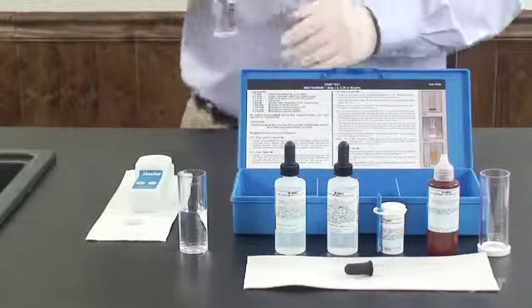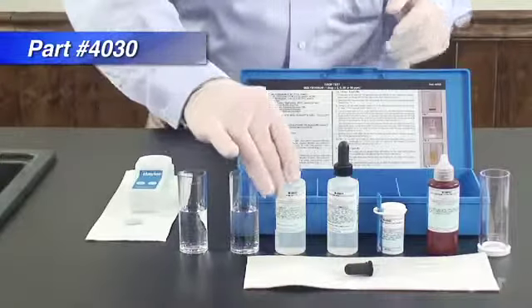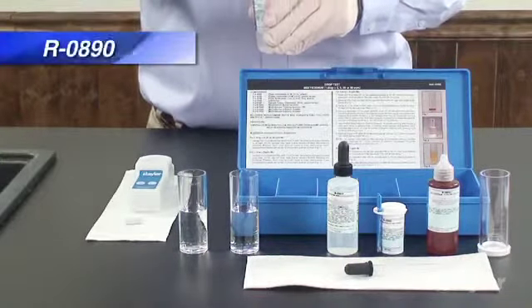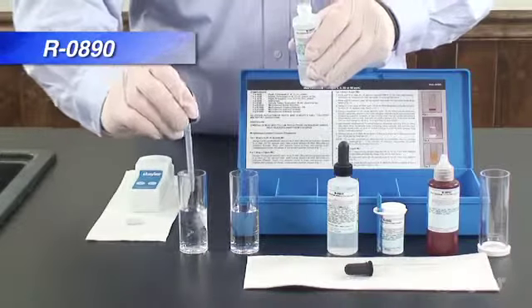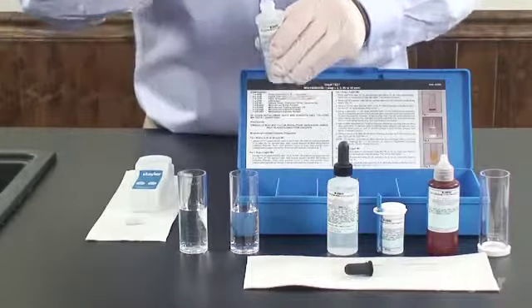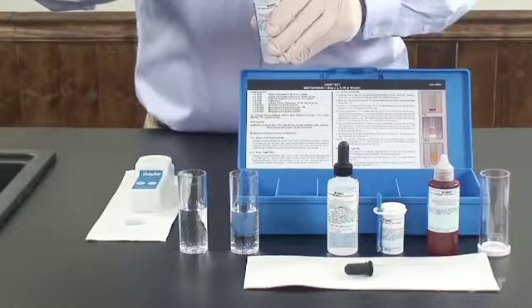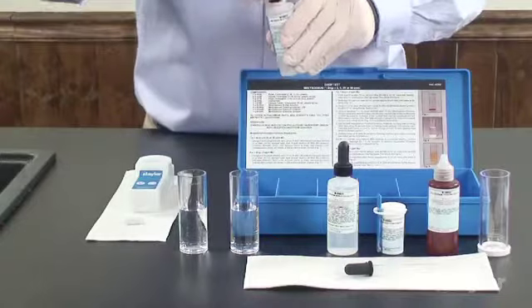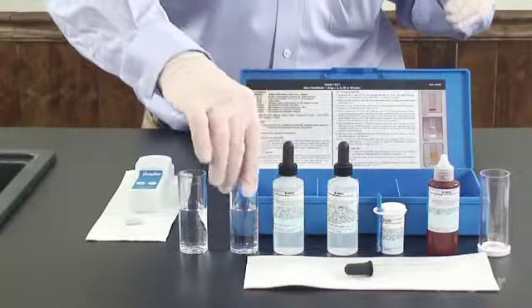Using a 1 milliliter pipette, add 1 milliliter of molybdenum buffer solution to each 25 milliliter sample tube. Swirl to mix.